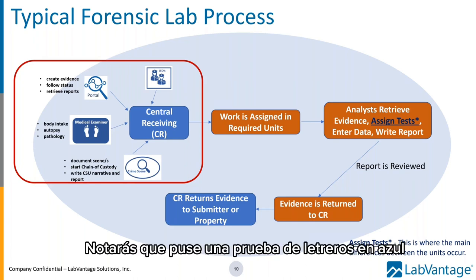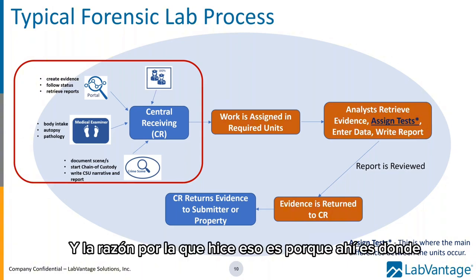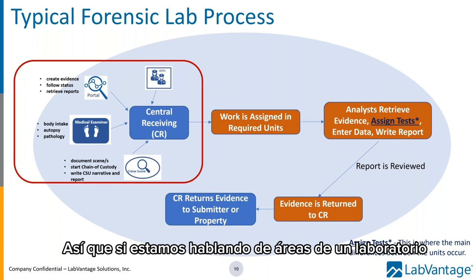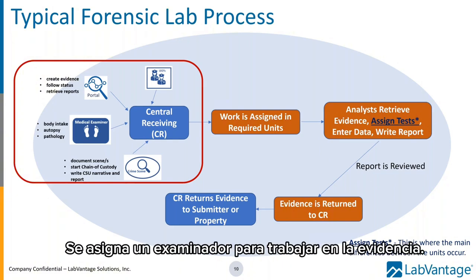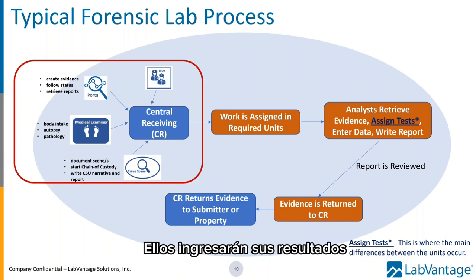You'll notice that I put assign tests in blue. And the reason I did that is because that is where there's often some differences in the workflow. So if we're talking about areas of the laboratory such as drug chemistry, firearms, question documents, digital evidence, in those areas, the typical workflow is that an examiner is assigned to work on the evidence in their unit. That one person will assign the test, they will enter their results, and they will ultimately write the report.